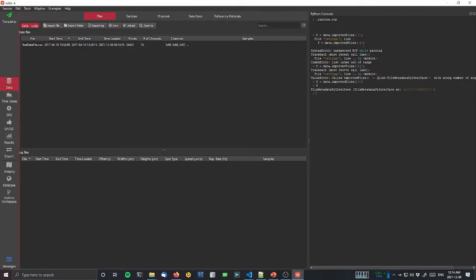Okay, so now we have our f value, so that's our file thing, and if we say show me the properties, it will have our metadata. And like I said, that metadata will stay associated with this particular file because that's where it got the metadata from, within this experiment. And then you can use it in your other Python modules if you want to extract this data some other way.